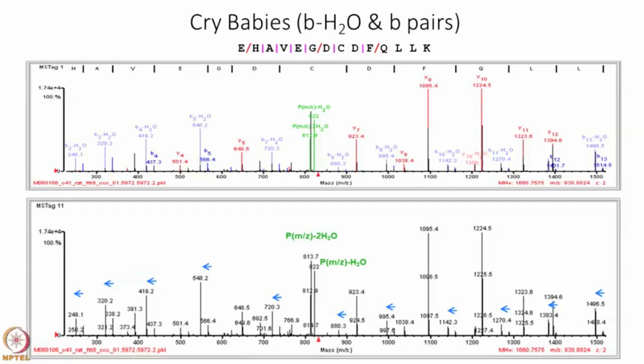So hopefully what I've tried to give you is a feel for how incomplete the information is in some of these spectra. Okay. Any other questions before we adjourn?